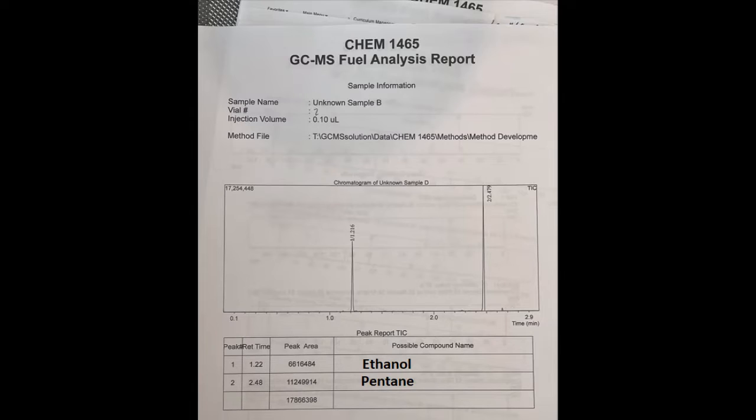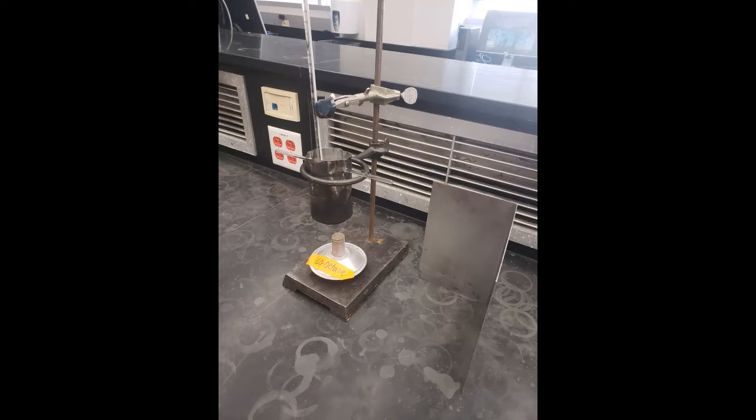For part 2 of this lab, you will use an aluminum soda can as your calorimeter that will contain water, which will be mounted above one of the 2 unknown fuel burner samples you will be analyzing. A thermometer will be inserted to measure temperature, as well as a glass rod for stirring. In this experiment, we will be analyzing the fuel burner for isooctane.